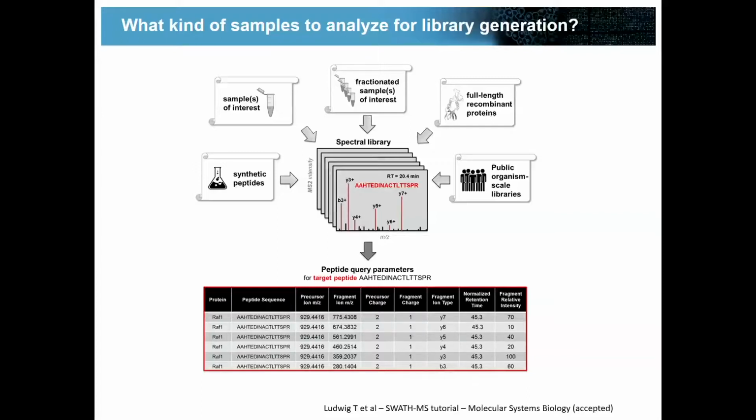So in our lab, we used to synthesize a lot of peptides in this dirty synthesis mode, this solid phase spot synthesis mode, where you would synthesize a lot of peptides in 96-well format for like $10 or $20 per peptide. This can also be useful. Other labs have gone for full-length recombinant proteins or synthetic proteins. This also has its advantages, and we'll talk about that later on.